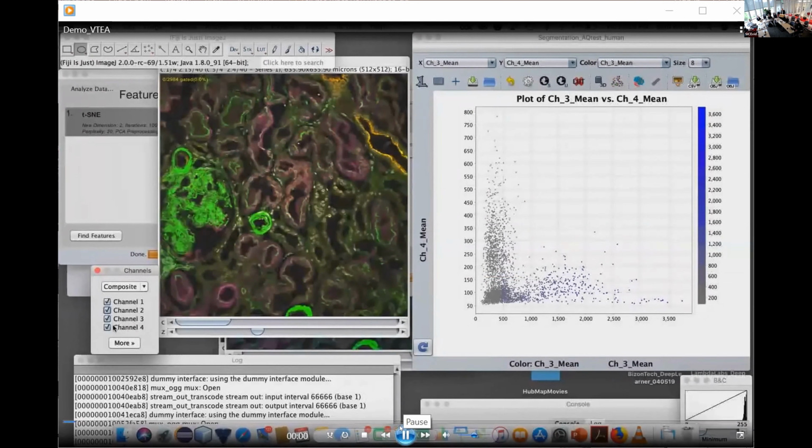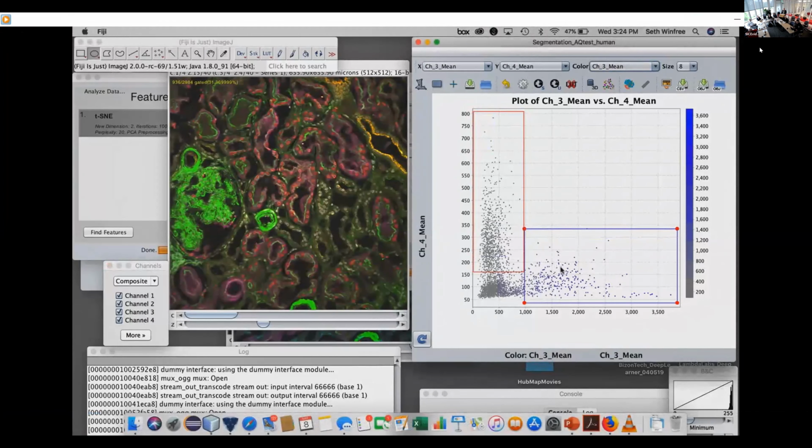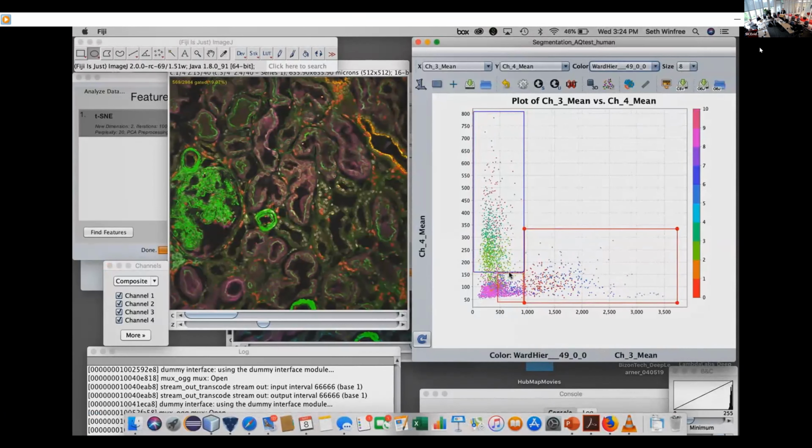All right. So here, this is that same volume again. I left it in here for consistency's sake. And basically, we have two tubular markers. One is sort of a magenta purplish color, and one is a yellow color, and there's also green for F-actin. And here I've already segmented the cells. I'm going through and doing the gating on the scatter plot itself, and then trying different kinds of channels, or a lookup table.